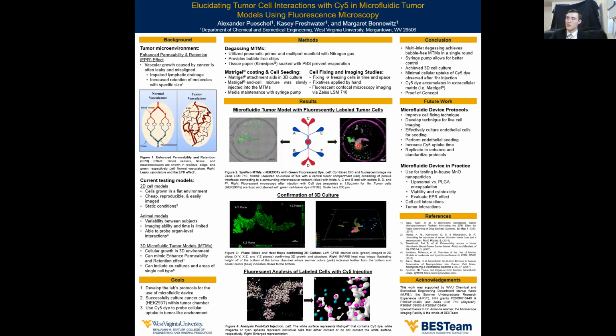This time we turned the magenta labeled matrigel into this white surface. And as you can see, the cells are now cyan and magenta spheres. The magenta spheres are ones that are touching the white surface, and cyan are the ones not touching the white surface. What do we conclude from this?